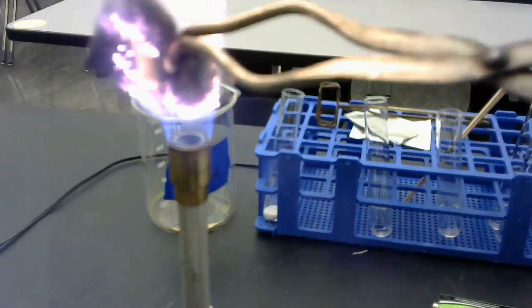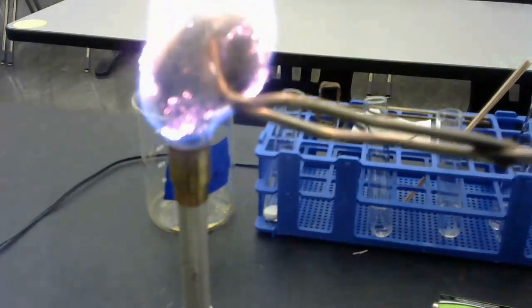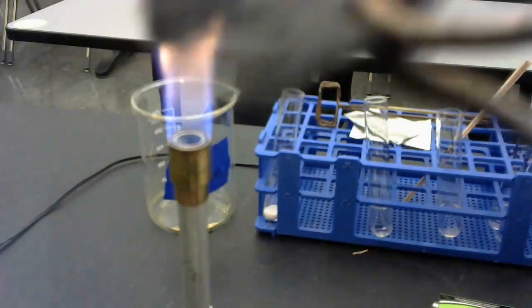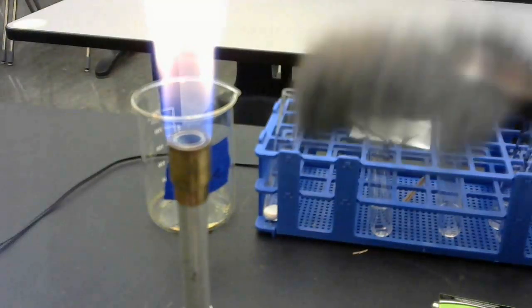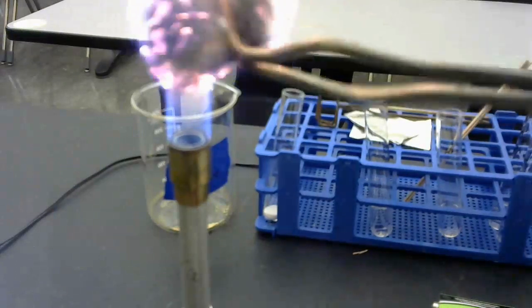In the end, the steel wool was a light gray, like light gray hair almost, okay? Now, when I take it out of the flame, I end up having a much darker gray clump right there, though it's hard to see on this camera. We have the iron reacting with the oxygen in the air as we heat it, to produce iron oxide.